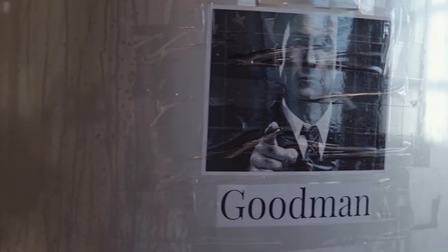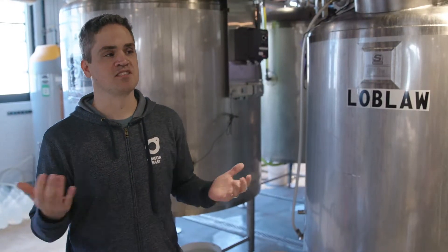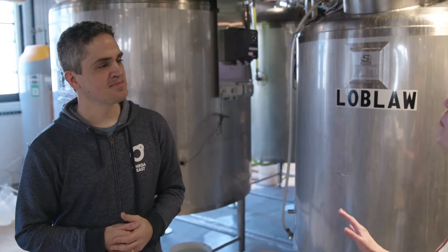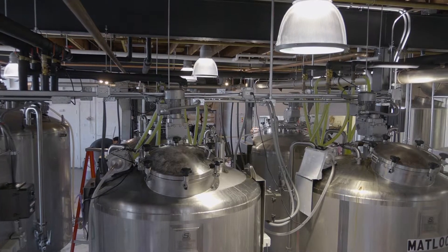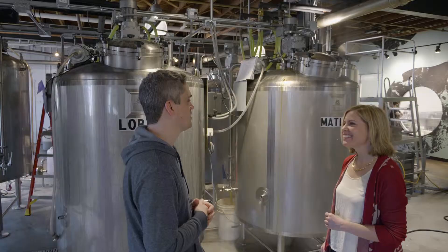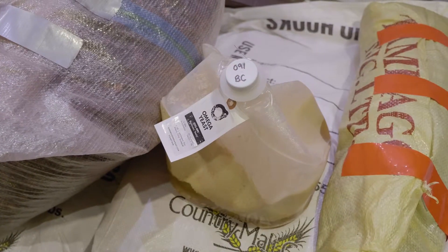I'm starting to see a little bit of a theme with the names of your tanks. Why don't you tell us about that? We've got McGill and Goodman over here, Loblaw, Matlock, Mason, and Hutts. If you put it together, these are all fictional lawyers — it's kind of a nod to our background. You couldn't leave the law behind. We couldn't, so now I have to see it every day. In here, that's just more of the wort you've created. Yeah, we use the big boil kettles to produce large volumes of wort that end up in these tanks to grow ever more yeast. When the yeast is done growing, the mixers get turned off and the yeast all just settles to the bottom. Then we get rid of our beer — whereas a brewery wants to keep the beer, we want to keep the yeast. So we get rid of our beer, which would be very oxidized and gross. It is drinkable, but it's not good. So we drain all that beer out and then package the yeast and send it out to customers all over the country.